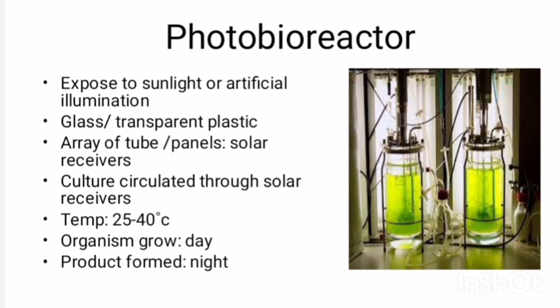Last one is photobioreactor. These are specialized bioreactors. It is carried out by exposing to sunlight or artificial illumination. Artificial illumination requires high cost.